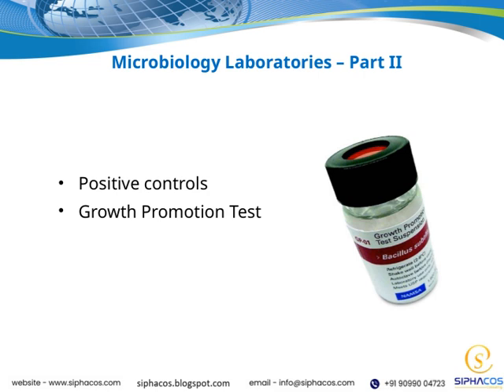If the positive control works as expected, but the test sample does not, we can be more confident that any negative result is genuine, not due to a flaw in our testing process. This is crucial for maintaining the reliability and validity of our microbiological testing, especially when we're evaluating products for safety and quality. In summary, positive controls serve as a benchmark, verifying that our testing system is capable of detecting microbial growth when it should, and helping us identify any issues that might compromise our results.